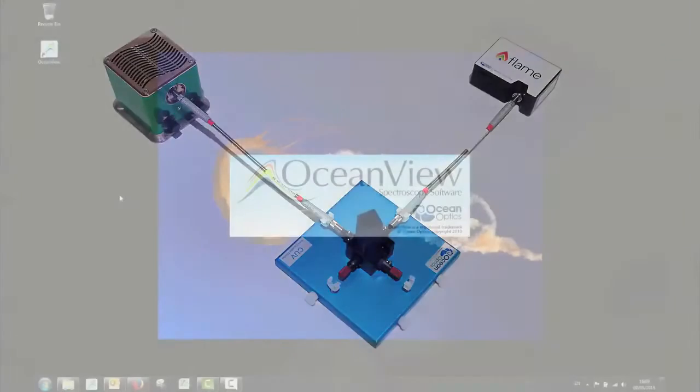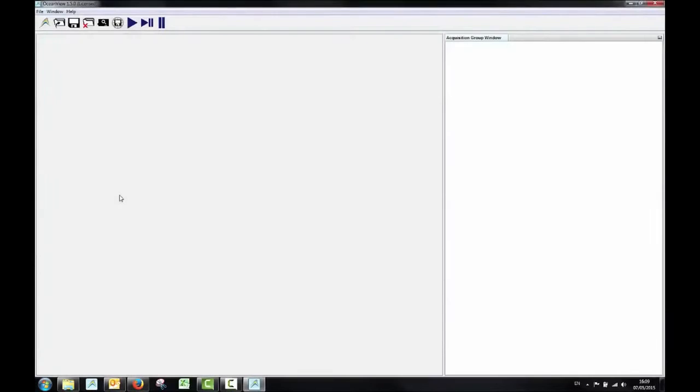Now you are ready to connect your spectrometer to OceanView software to begin collecting data.